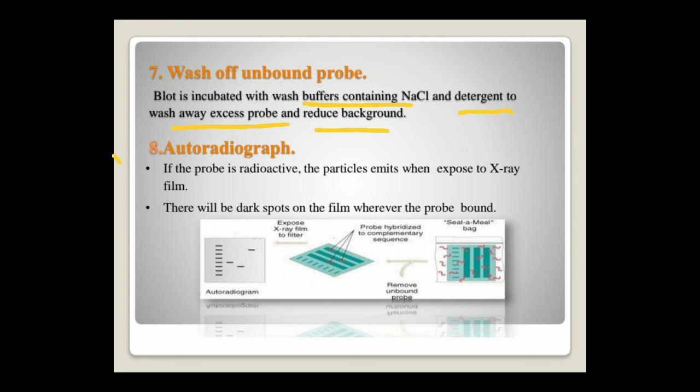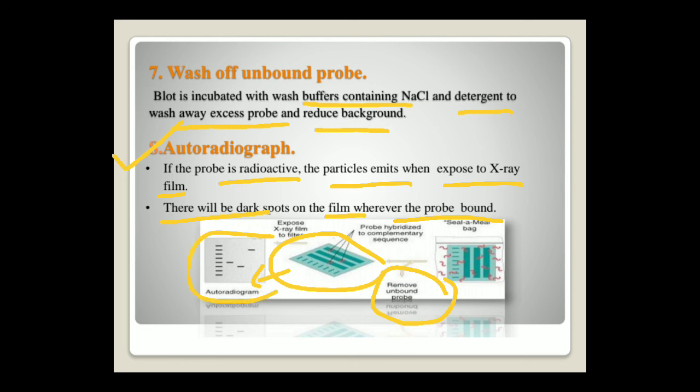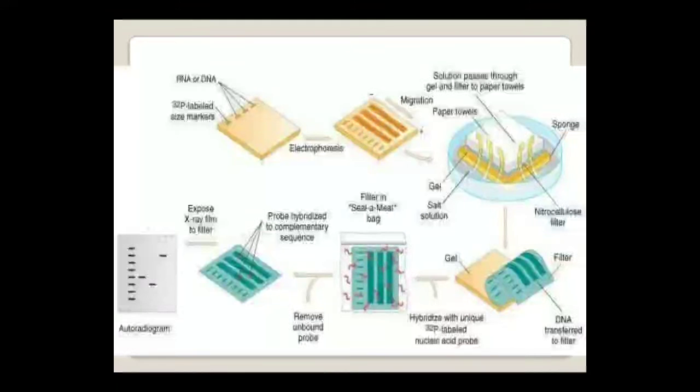The last step is autoradiography. Since it is a radio-labeled probe, the particles emit radiation when exposed to X-ray film. There will be dark spots on the film wherever the probe is bound. Here you can see that the probe is hybridized to the complementary sequence, and washing removes the unbound probe. Now this is exposed to the X-ray film, and this is what you see as a result. The dark bands represent the bound probe.